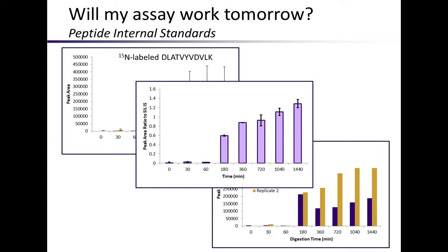If you look into this with the 2 different replicates, in replicate 1, something happened at the higher time points. We're just getting a lower signal for all of the higher time points, which is what's leading to this peak area change. So what I actually did was normalize this signal to my internal standards.